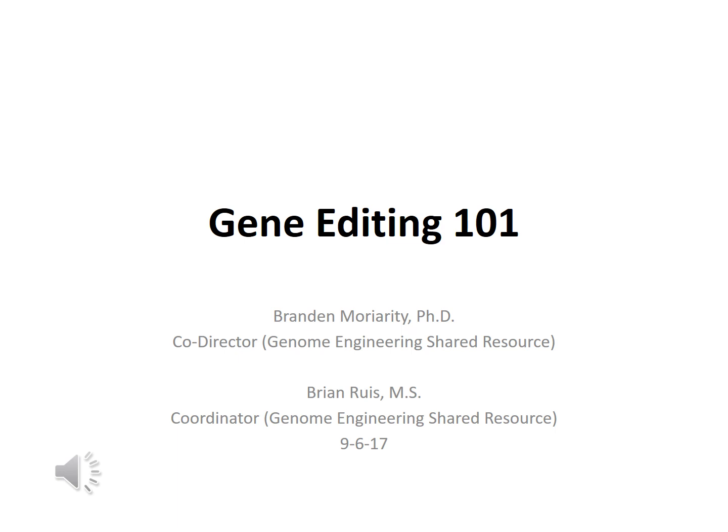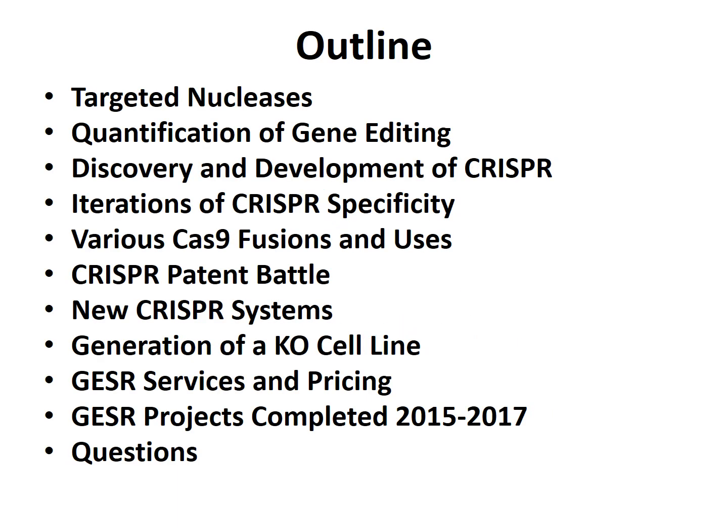He will get into the nitty-gritty details of how to generate CRISPR reagents to generate knockout cell lines for basic research, and how to actually implement those and identify gene-edited clones for your research. We'll have extra time for questions and answers, with the goal of everyone leaving being able to go back to their laboratory, design and implement their own CRISPR guide RNAs for gene editing of their cell lines of choice. Here's an outline of the talk. I'm not going to go through it all now, but we're going to cover a lot of material, on the topics I just described.